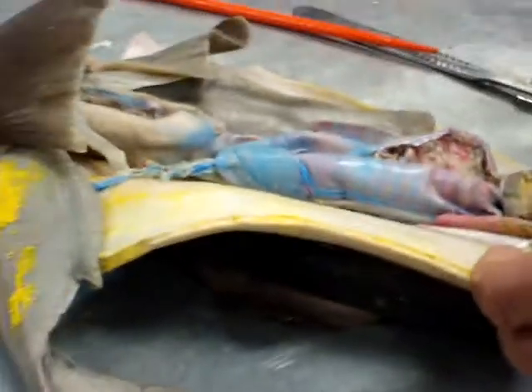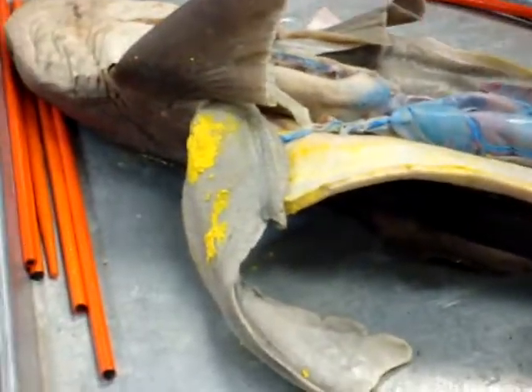That spiral valve looks much better than ours does. If we rinse ours out, it would look just like that, actually. Rinse ours out. Gross. We can do that.